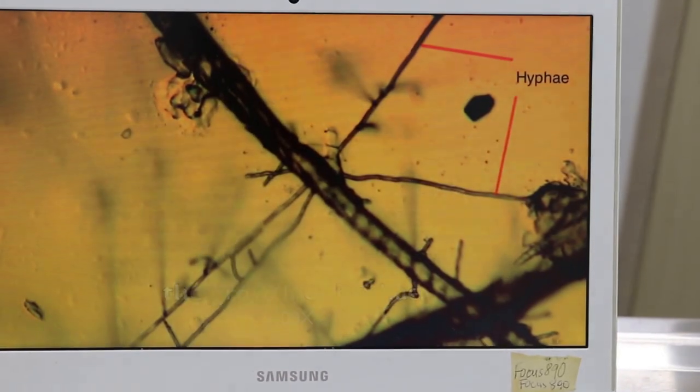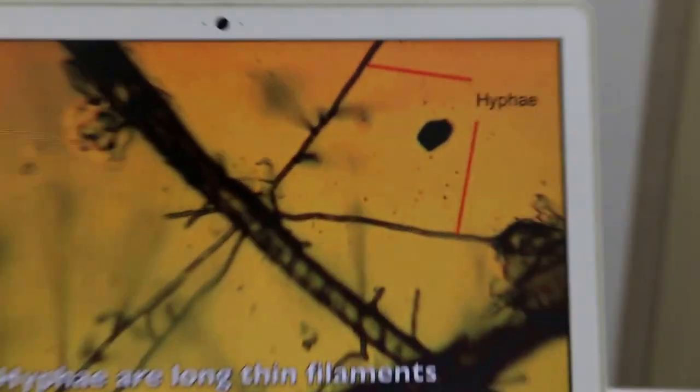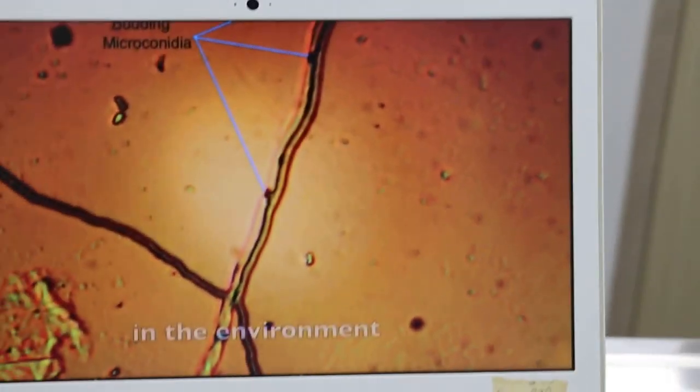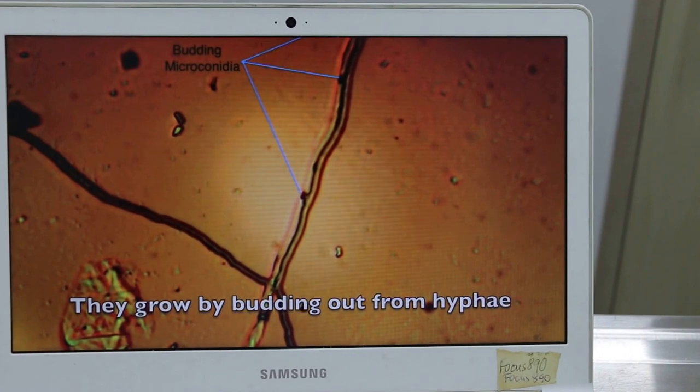They just become a microscopic hyphae. Hyphae are long thin filaments. They can be observed branching out and around hair shafts. Under the microscope you can see the spores from the environment, they grew by budding out from the hyphae.